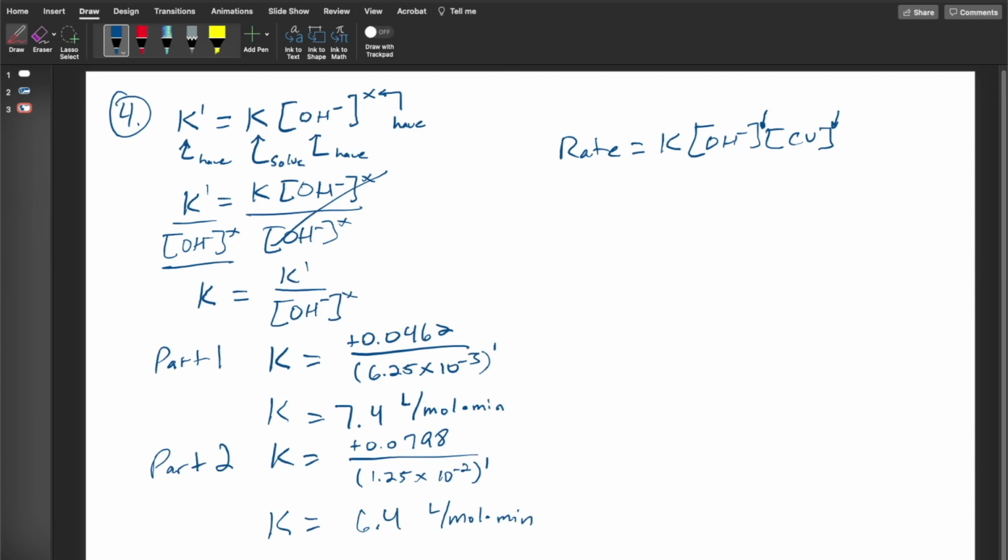And then the last question says, obtain the rate constants from your classmates and compare your results, right? You all did the same experiment, so you all should have very similar numbers. And when you compare with your classmates and you have drastically different numbers, then you need to be able to tell me why that happened. What are the possible errors that could happen? Don't just say that it's human error. I want to know exactly what kind of error you're talking about, right? And all that needs to be discussed in the discussion section of your lab report that's due on October 20th, right?